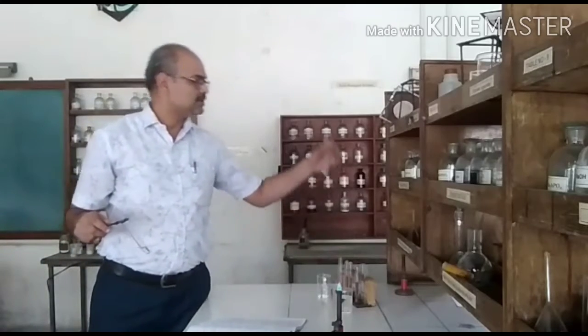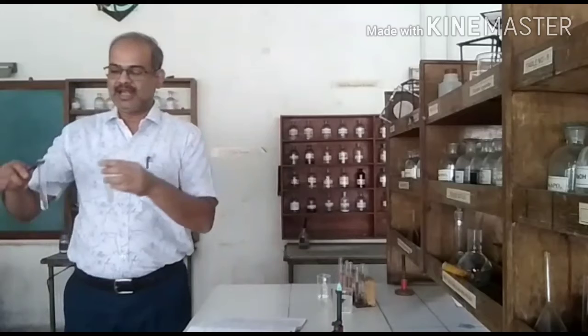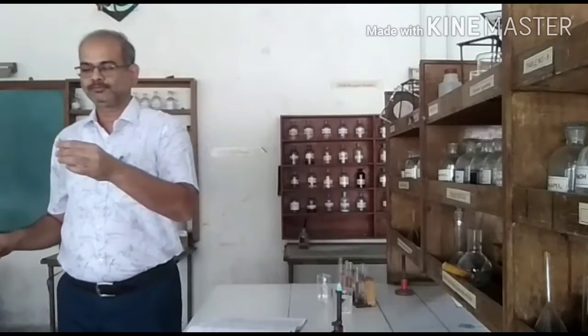Okay. Now this is the white PPT which I have got after adding lead acetate. In this white PPT, I will add ammonium acetate, which is hot.